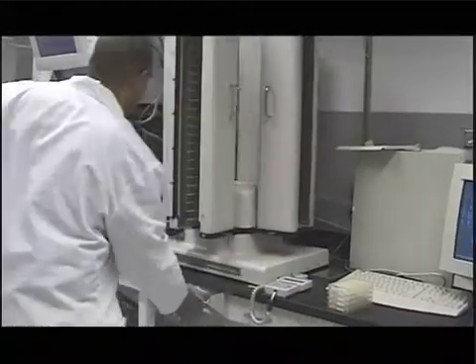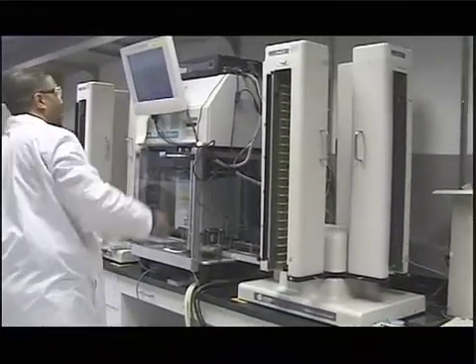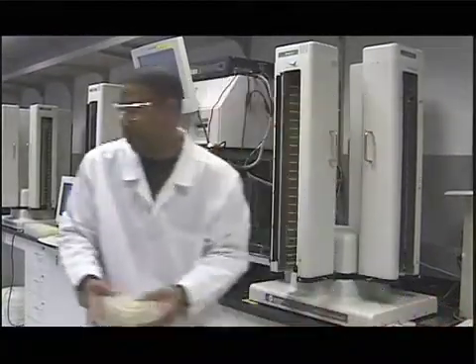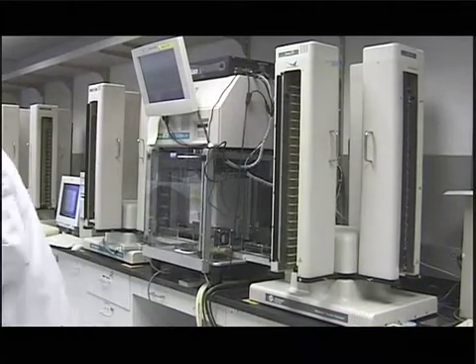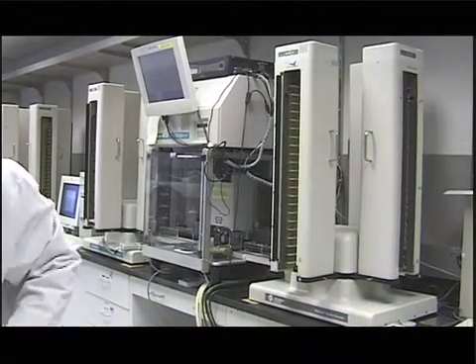In Inoculation Core, they're responsible for taking a small aliquot of these cultures and transferring them into a larger culture, which is a 96 well plate.